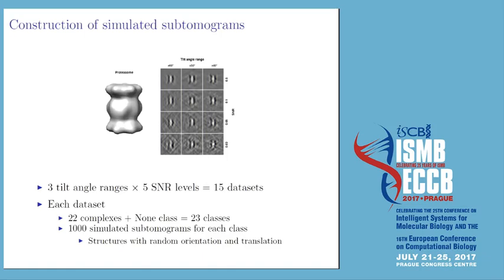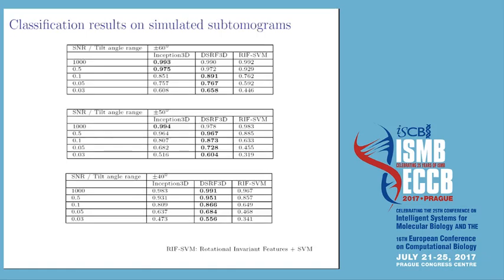So this is the prediction accuracy. We can see that our new approach has achieved a significant increase of the classification accuracy compared to our previous method, which is a rotational invariant feature-based method.